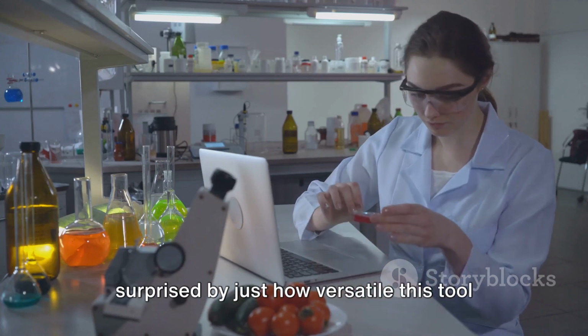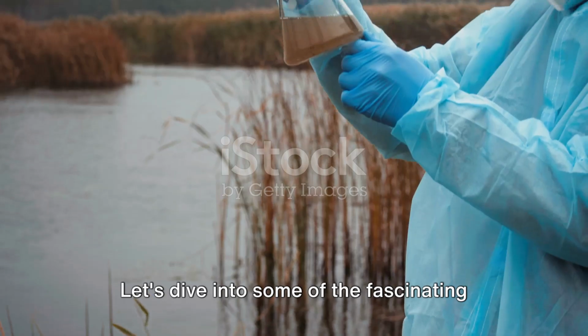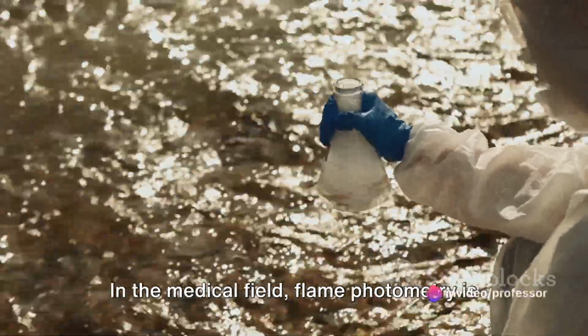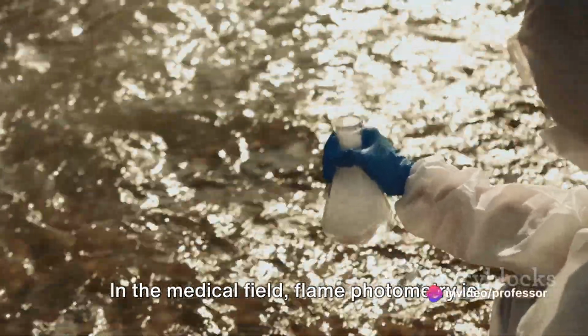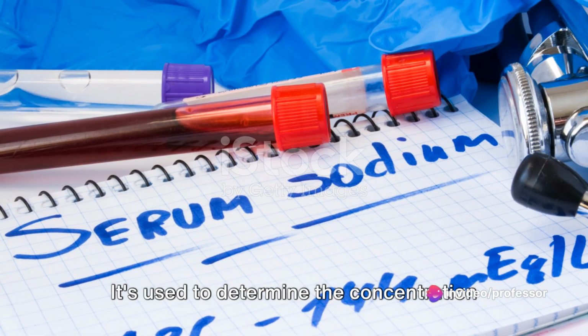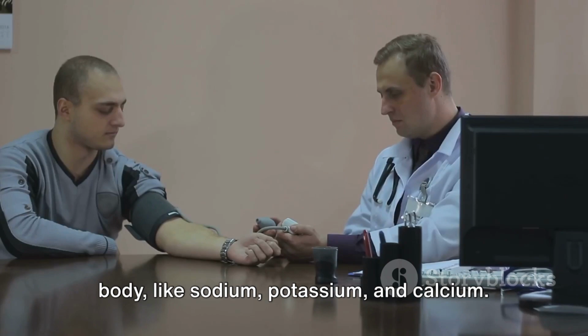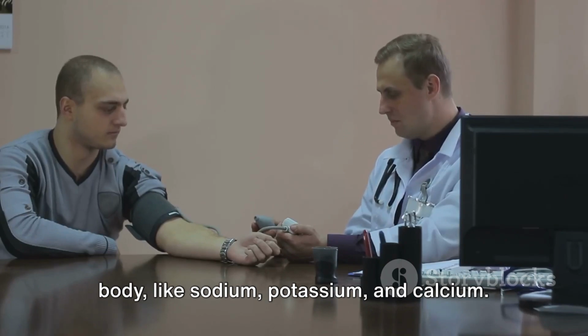You may be surprised by just how versatile this tool can be. Let's dive into some of the fascinating applications of flame photometry. In the medical field, flame photometry is a trusted ally. It's used to determine the concentration of certain essential elements in the human body, like sodium, potassium, and calcium.